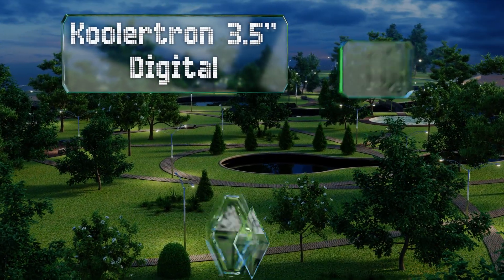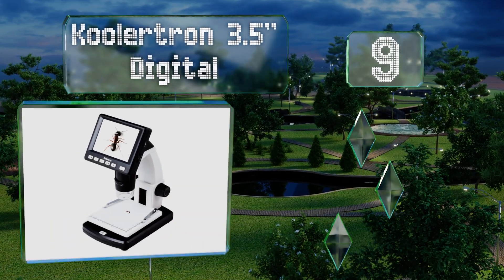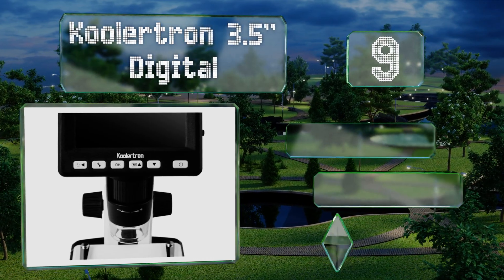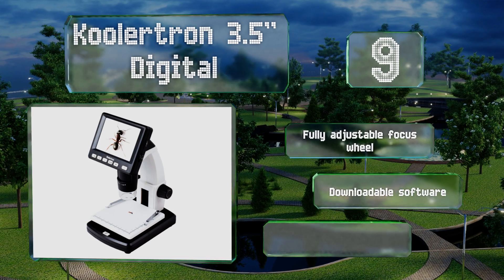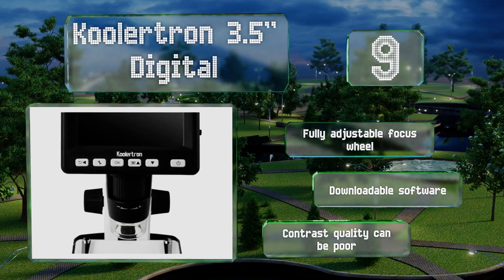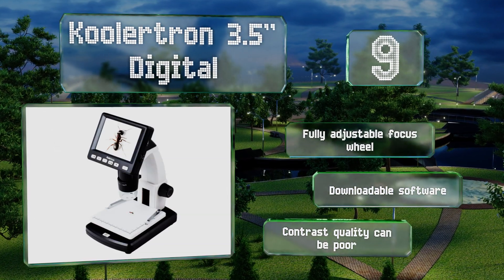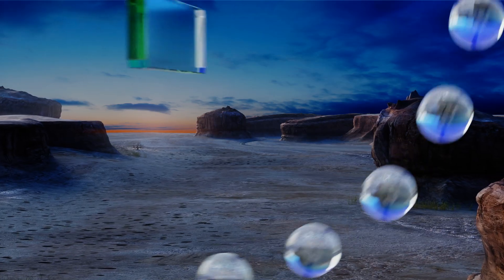At number nine, the Coolatron 3.5 inch digital magnifies within the 20x to 300x range, and you can insert notes on the images you capture with the 5 megapixel camera. The lithium battery supplies power for two hours, and this model is easy to carry out and use in the field. It's equipped with a fully adjustable focus wheel and includes downloadable software, but its contrast quality can be poor.